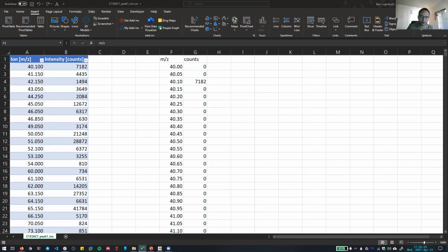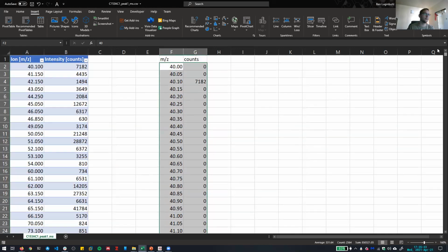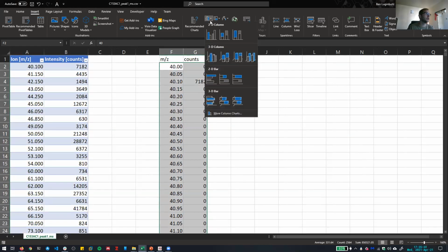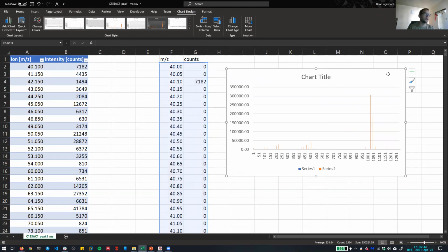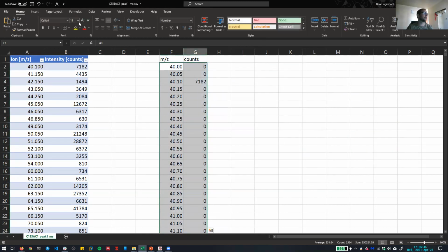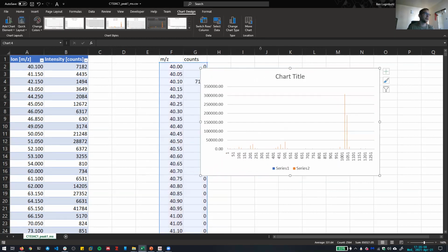Looking at the key that I made earlier. It is a column graph, should be clustered column. Why is that not working? Let's just try that. Scroll back up. Insert a clustered column. So, okay, oh, one second. Let's just do that again, sorry.